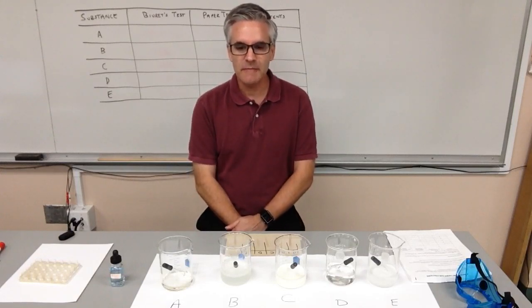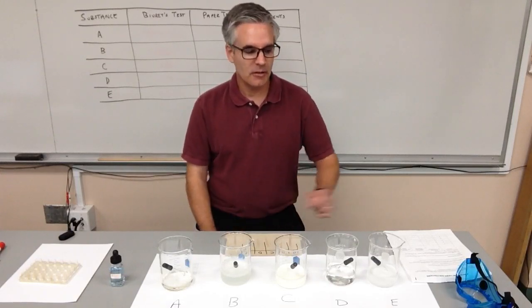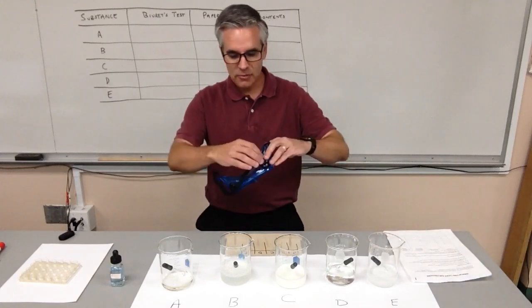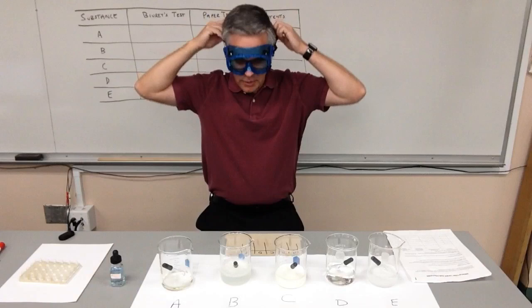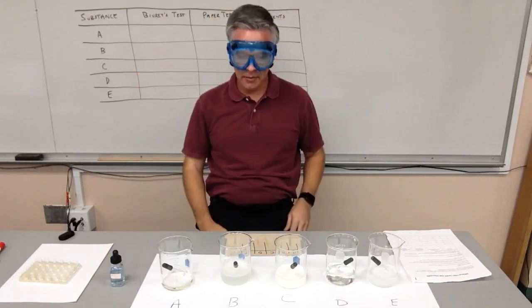And so safety-wise, I want to make sure that since I'm dealing with different chemicals that I'm trying to keep stuff off my skin and make sure I don't get it on my clothes because it could ruin my clothes. And I also want to make sure my eyes are covered, so I have my goggles again today. And so goggles are a must whenever we deal with anything with any sort of chemicals at all.